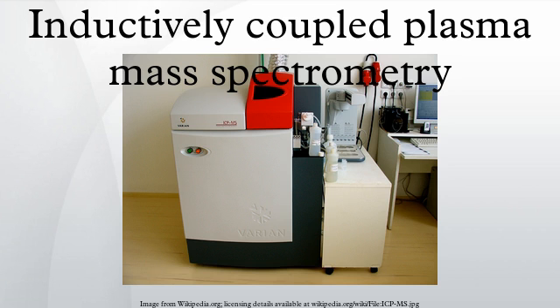If the instrument is in an environment where it gets infrequent use, then buying argon in the gas state will be most appropriate as it will be more than enough to suit smaller runtimes and gas in the cylinder will remain stable for longer periods of time, whereas liquid argon will suffer loss to the environment due to venting of the tank when stored over extended time frames. However, if the ICP-MS is to be used routinely and is on and running for 8 or more hours each day for several days a week, then going with liquid argon will be the most suitable.